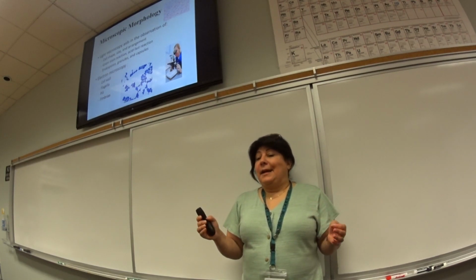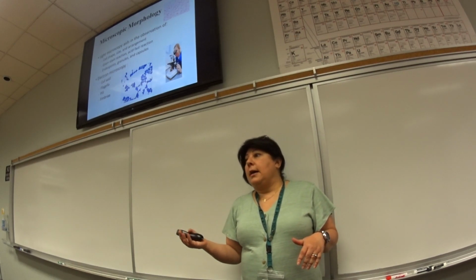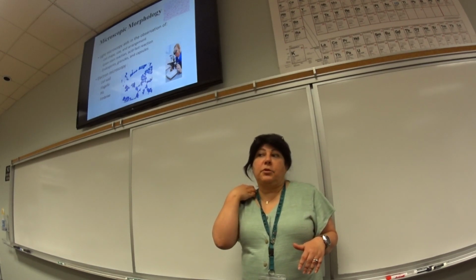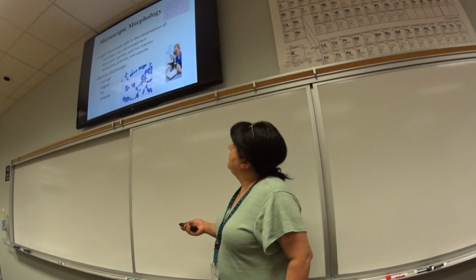Now, is it individual bacilli or rod, or is it in a chain, streptobacilli? If it's cocci, is it individual cocci? Is it staphylococci? Is it streptococci? All of those are characteristics for you guys. So you will look at it that way.